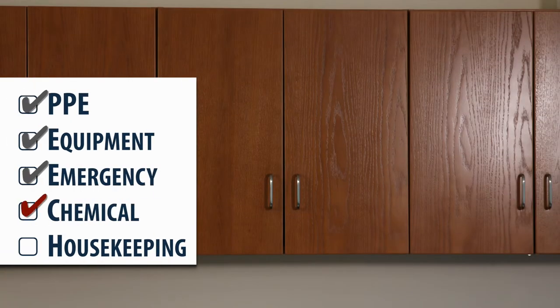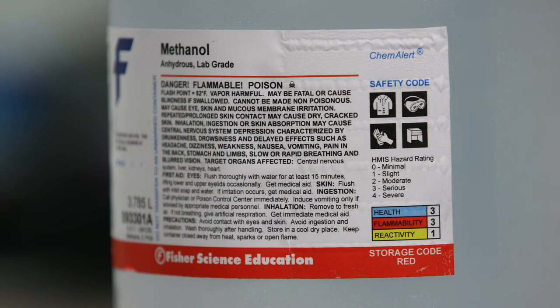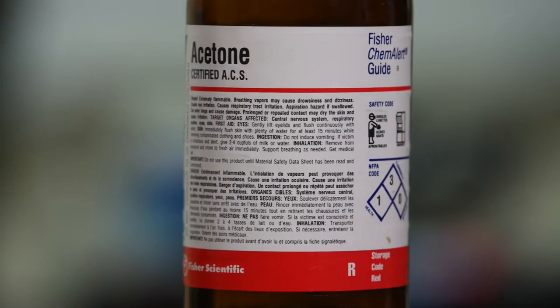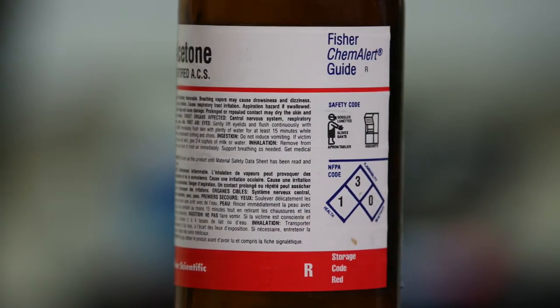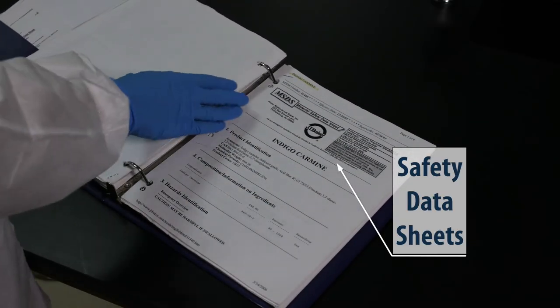Next is chemical safety. All chemicals in the lab must be labeled and organized. Labels provide important safety information like the chemical's properties, the manufacturer, hazards, PPE, and storage requirements. You can find even more details about the chemicals by looking at the safety data sheets.